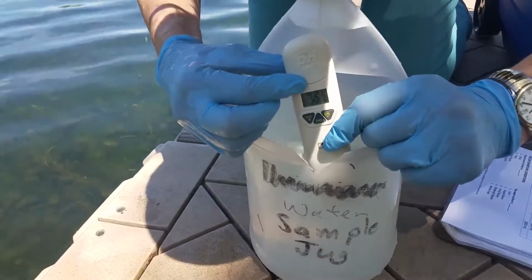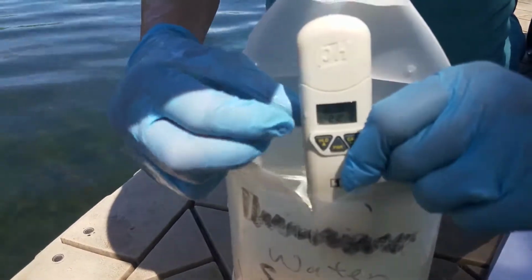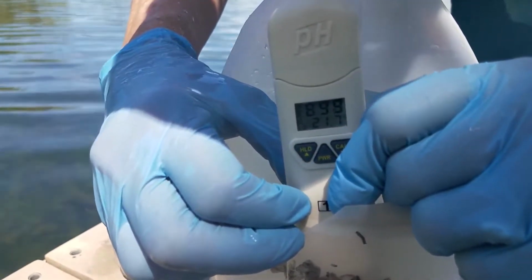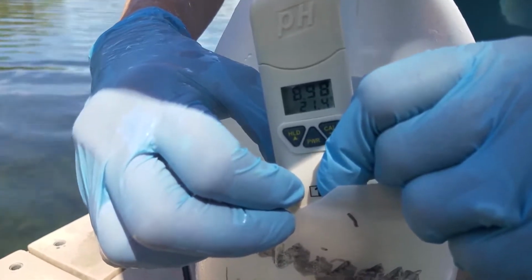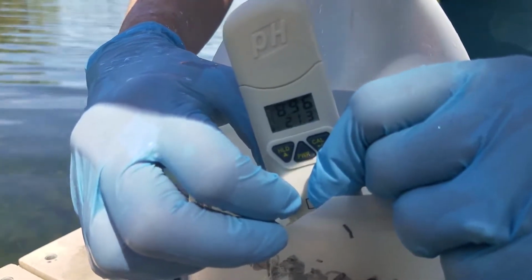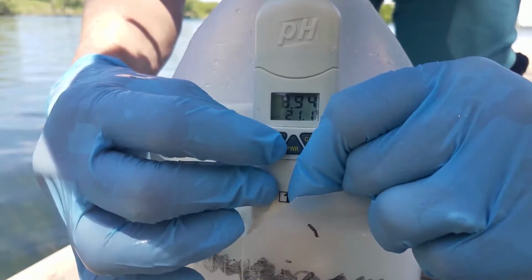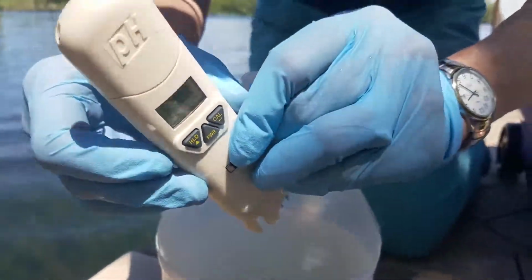I'm kind of holding this for your benefit so you can look at the screen. As I talked about earlier, the upper part of the screen is the pH measurement, and the lower part is the temperature measurement. You'll see the numbers are kind of moving around, and while they're moving, you will notice the decimal point on the pH reading kind of flashing. When the numbers have stabilized, it takes about a minute, when you think they're pretty stable, you simply hit hold. Right, pretty there. Stable, yeah. And hit hold, and then that reading will freeze.